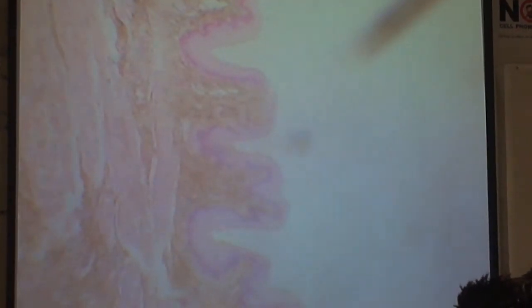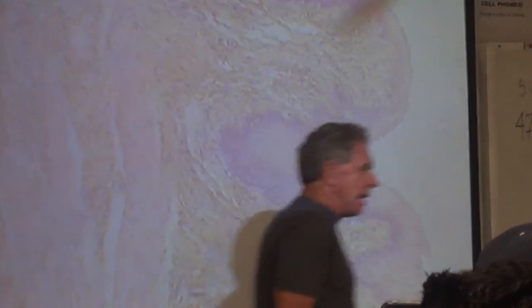If we do this, we'll go in this direction and look at it under slightly higher power. Can you point with the ruler? Because I don't know why I can't see the red dot. Sure. I just didn't want to get in people's way here. My battery's getting old in my laser pointer.